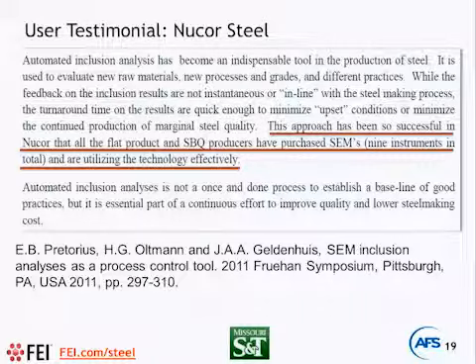Okay, so I hope that gives a good overview of the automated SEM-EDS technology and its implementation in the steel mills. Okay, thank you. Now let me continue about application for foundry business.